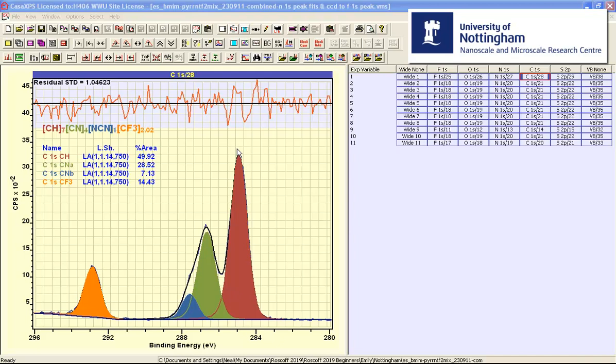Monte Carlo simulation is a method where we take the peak model and we simulate the data that corresponds to the peak model by introducing noise that is consistent with pulse counted data and then refitting the model to that data after the noise has been introduced. And then variations in the peaks as a result of the noise can be observed.